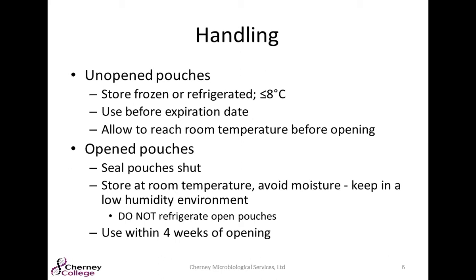As far as Petrifilm handling, your unopened pouches, when you receive them, should be stored frozen or refrigerated. 3M recommends -20 degrees Celsius up to 8 degrees Celsius. You want to make sure that you use it before your expiration date. Those nutrients and indicators that I talked about initially can degrade over time. So it's a good idea to only keep on hand what you can use before the expiration date, and allow them to reach room temperature before you're opening and using your Petrifilm.